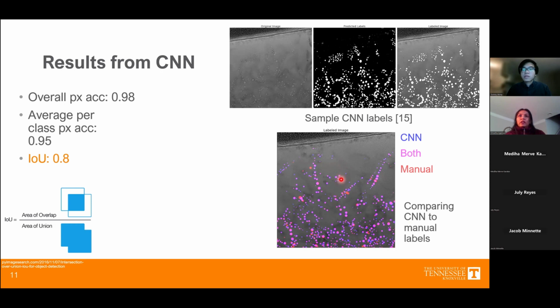To me, those values are very important. Despite IOU being a good measure and you're getting 0.8, there are two things. Once you do UNet, you can either compare directly your black pixel with your black pixel in the ground truth, and white pixel with the white pixel that you provided during masking.